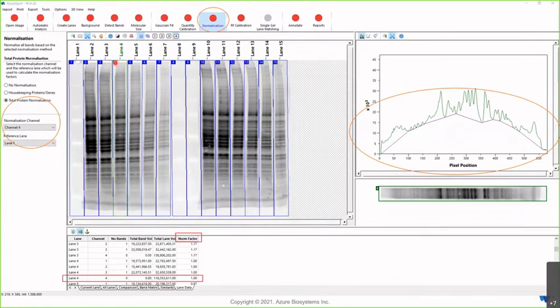You can see here, this is the histogram after background subtraction. See, the bands are not detected. We are quantifying the volume of all these peaks, not just single peaks. It's all of them. We should do that.